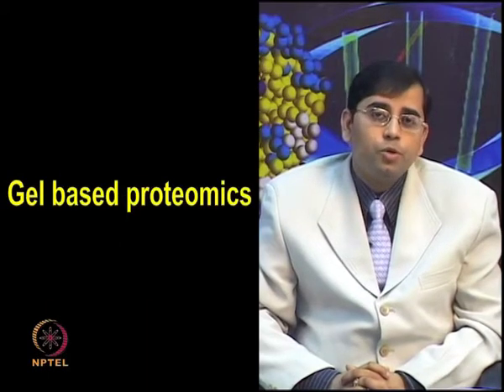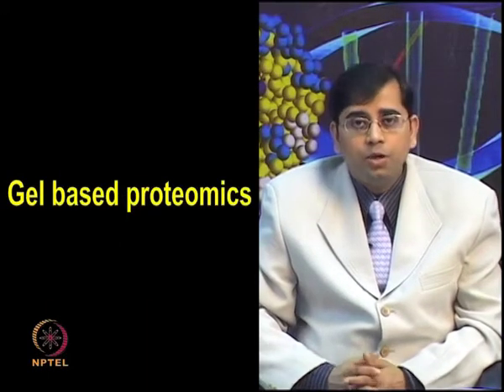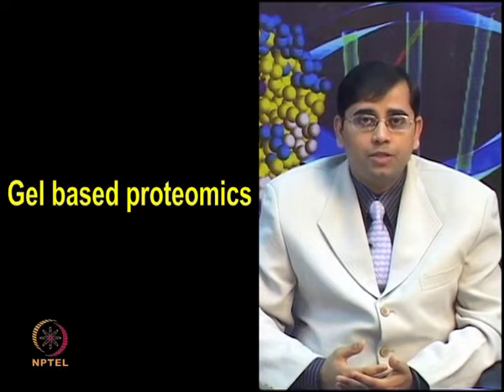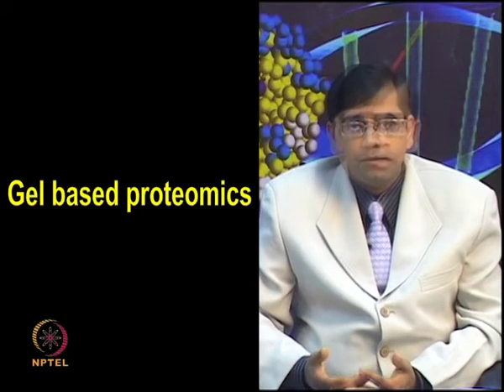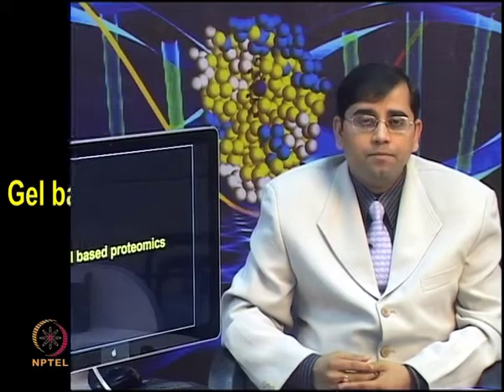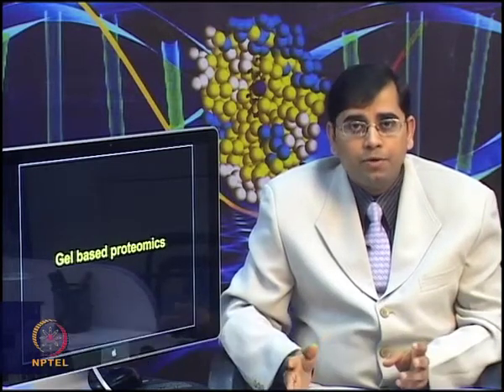So, we will continue our discussion on proteomics, and now since you have prepared a good sample, it can be applied either on gel based proteomics approaches such as two-dimensional electrophoresis, or it can be used for gel free proteomic approaches such as mass spectrometry. So, we will continue our lecture on gel based proteomics and then demonstrate how you can use your prepared sample further for analysis of complex proteomes such as serum proteome, bacterial proteome and plant proteome.